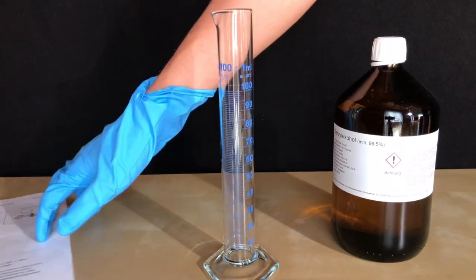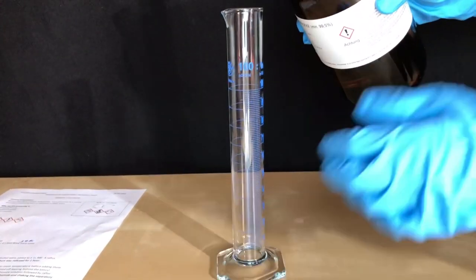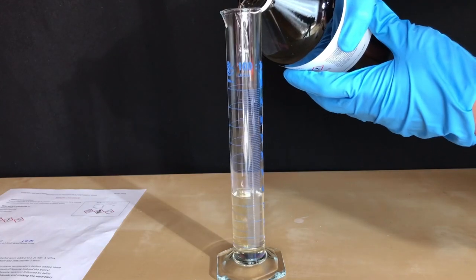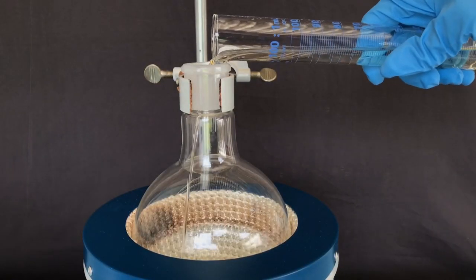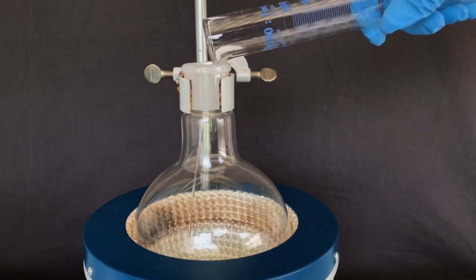Without further ado, let's begin. We started off by measuring out about 52 ml of Benzyl Alcohol. For good luck, we spilled some of it. The Benzyl Alcohol was transferred to a 1 liter round-bottom flask containing a stir bar.